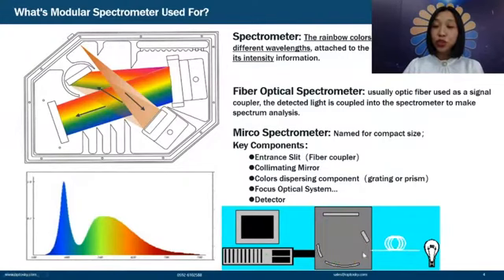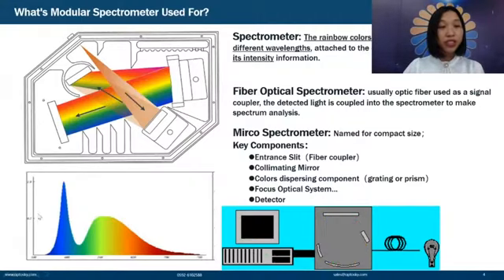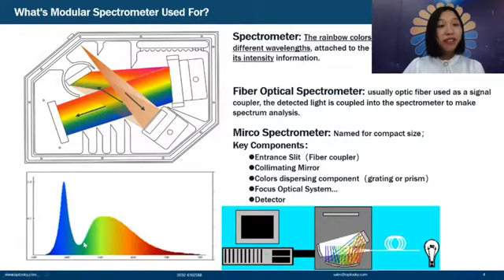But when it shoots into the spectrometer and is analyzed, we can see that it has rainbow colors. Then the spectrometer exports this data to the PC, and we can export the spectrum on the left. The spectrum tells us the wavelength information, and also the intensity information.